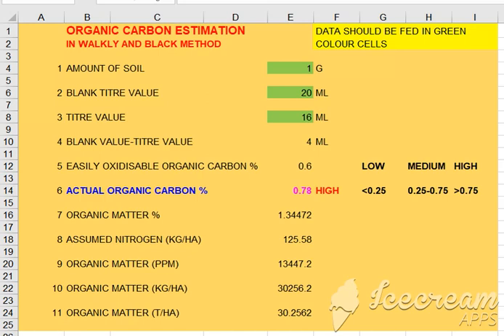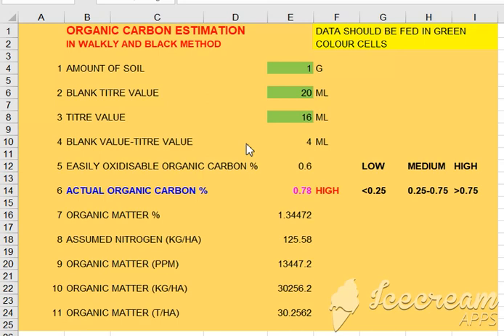Now we have an Excel program. The first amount of soil is 0.5 grams. You can see the green color and the blank titration value. The amount of soil is 1 gram. The blank titration value is 20. Soil is 0.5 grams. The titration value is 16. That is the soil sample. The blank titration value minus titration value is 4.